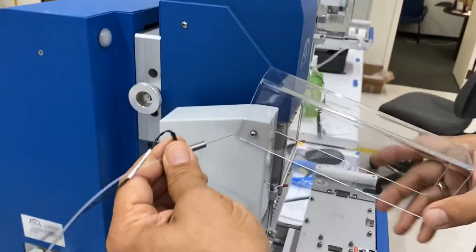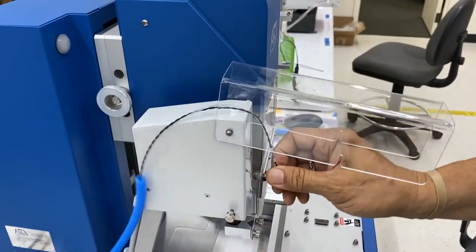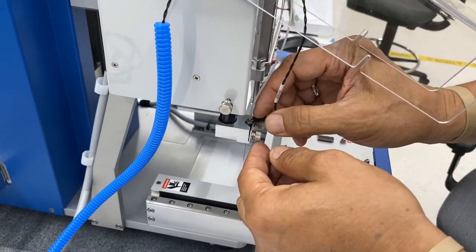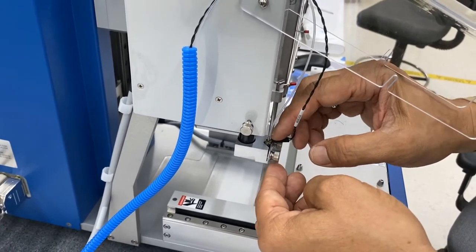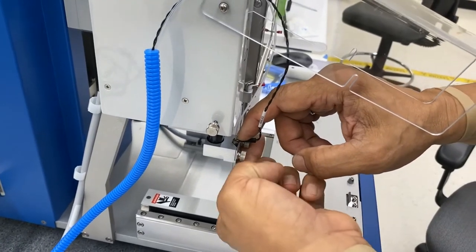Lift the protective polygraph cover. Insert into the nano clamp holder. Firmly hold with your finger firmly down and softly tighten the thumb screws.